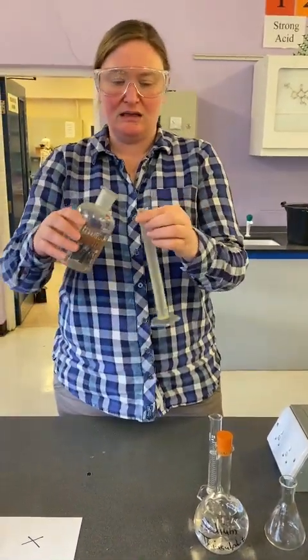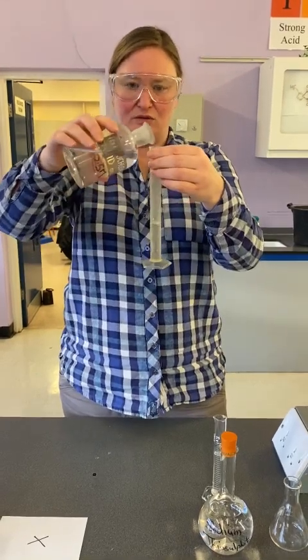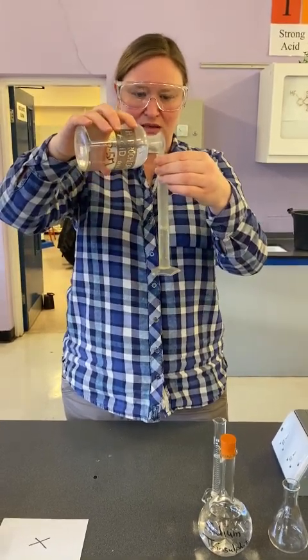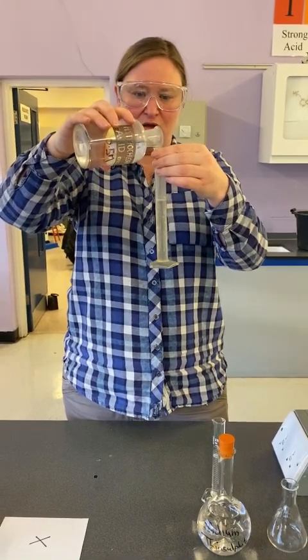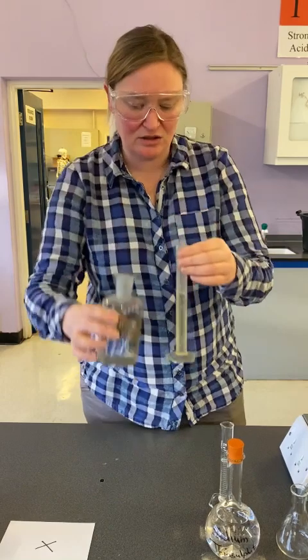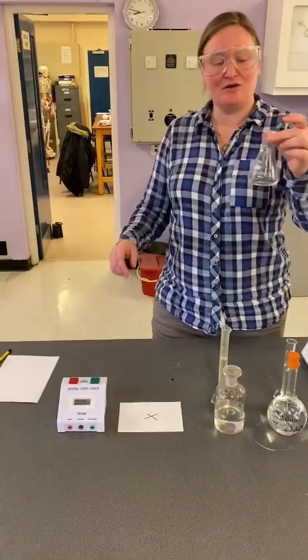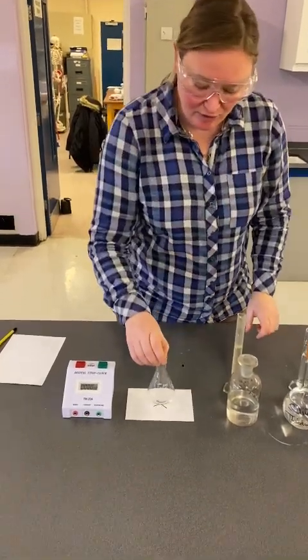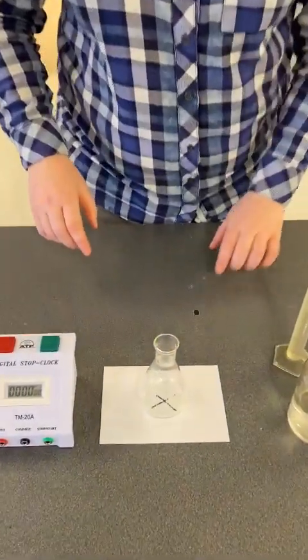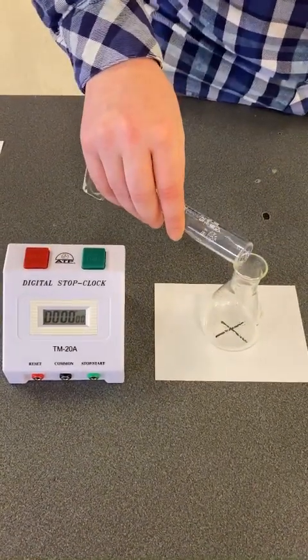So then we're going to take our plastic measuring cylinder and I'm going to measure out, this time, 20 mils of hydrochloric acid. So there's 20 mils in each of those measuring cylinders. I'm going to take the conical flask, which is shaped like a cone, which is where it gets its name from. I'm going to put on a piece of paper with a cross on. Why is the cross there? It will all become clear in just one moment.